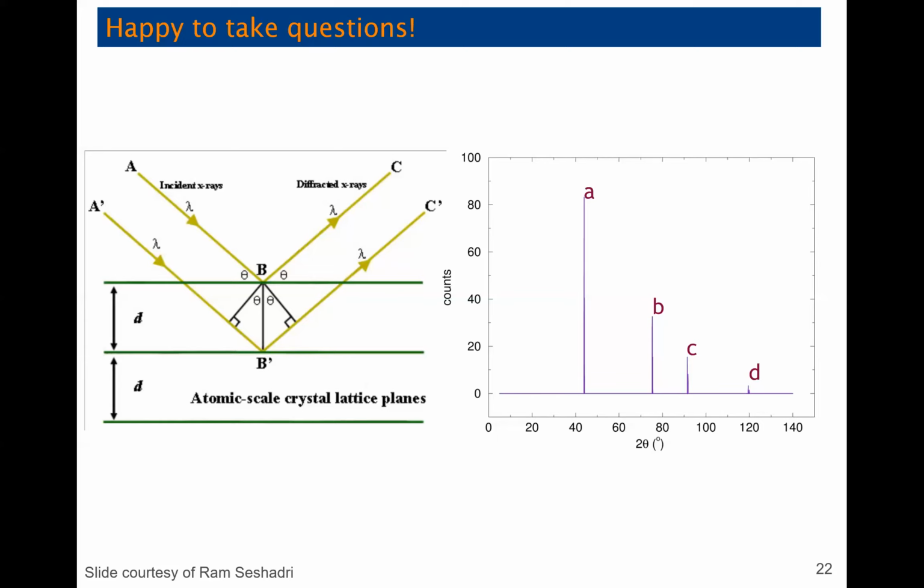So if you're starting from a mystery sample, it does help to start with various techniques we have for elemental analysis to say, okay, we saw these elements in there. Now you can plug those into your software and say, hey, among these elements, which have an X-ray diffraction pattern that matches some or all of these peaks, and it might have a better guess. Does that answer your question at all? Yeah, it does.